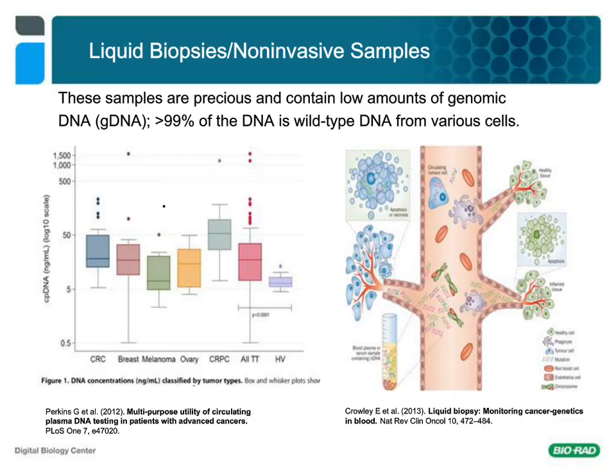However, there is very little DNA in plasma, about 5 to 50 nanograms per mL in advanced cancers, and the quality of the DNA is very poor, mostly apoptotic fragments. Most of the DNA is also wild type in nature, arising from the non-tumorigenic cells. These limitations have prevented the use of plasma DNA as a diagnostic test up until very recently.